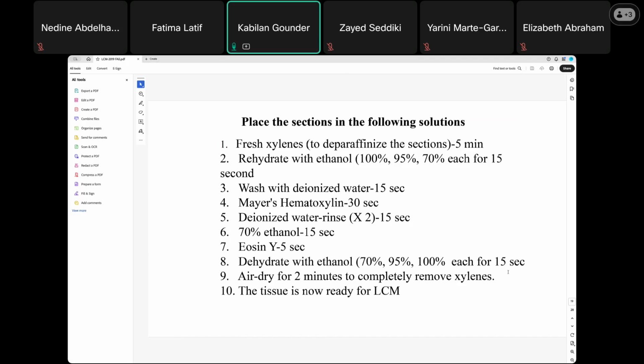So as we discussed, that's hematoxylin and eosin staining. Already we discussed this in light microscopy. This is the exact processing. First you have to deparaffinize the sections, or remove the OCT medium, that is optimal cutting temperature, the embedding medium. And then your sections stick onto the slides, and you can stain with hematoxylin and eosin.